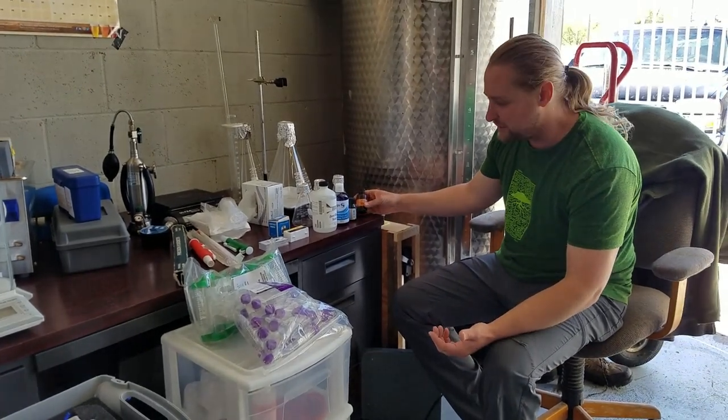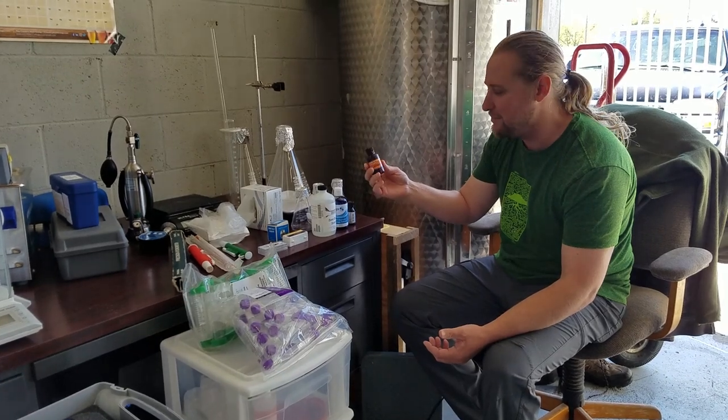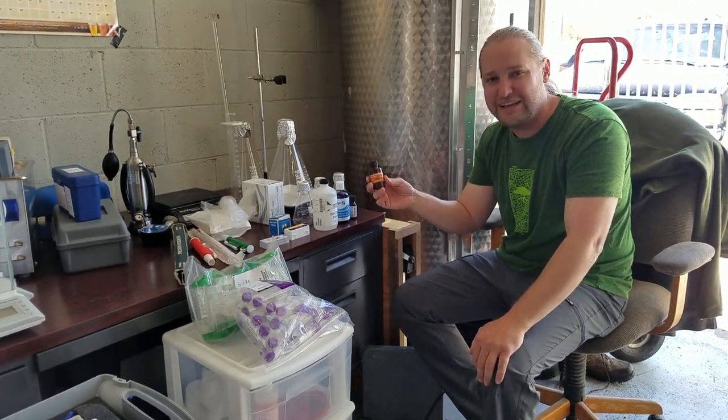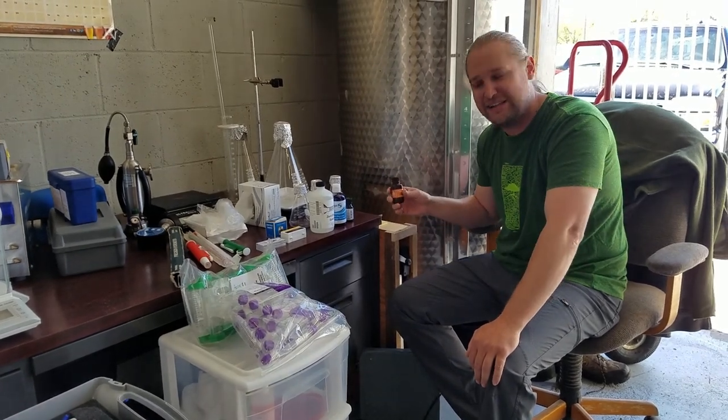Let's start with some solutions first. Here's our methylene violet, our alkaline methylene violet. This is what we use for viability stains on our yeast, counting our yeast cells. We don't use methylene blue, we use methylene violet — it's supposed to be a little bit better, so maybe try this out.